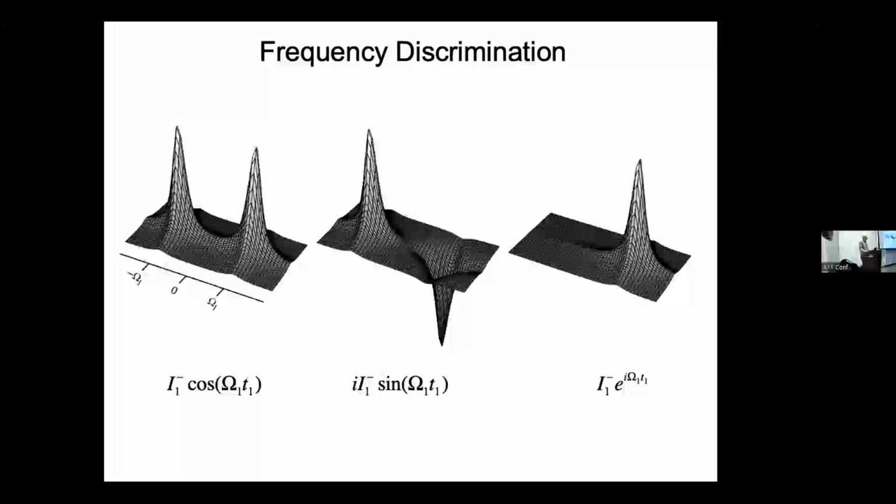This doesn't come up in acquisition because during acquisition, the spectrometer is designed to measure both the X and Y projection of the precessing magnetization.